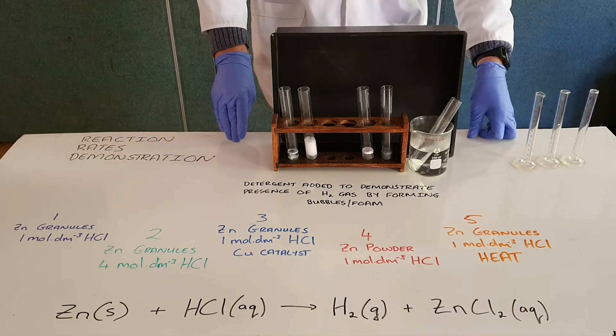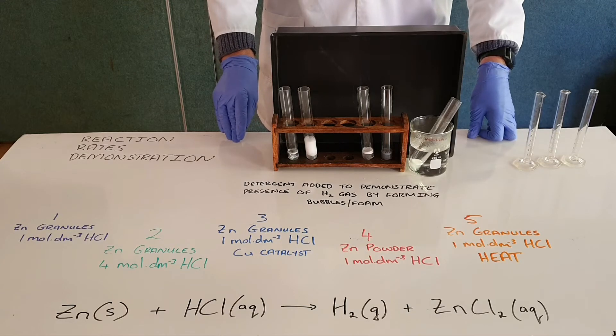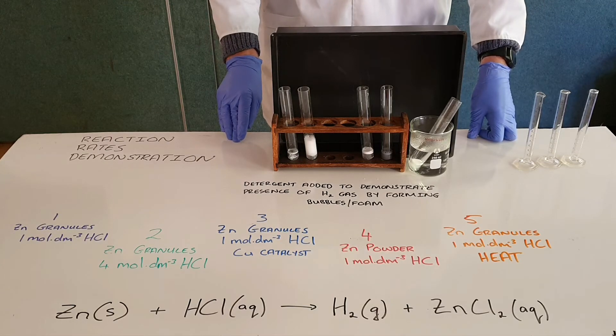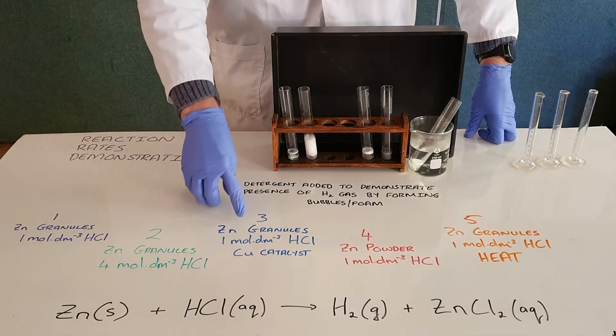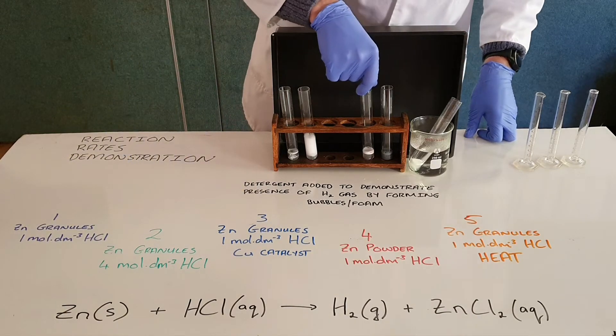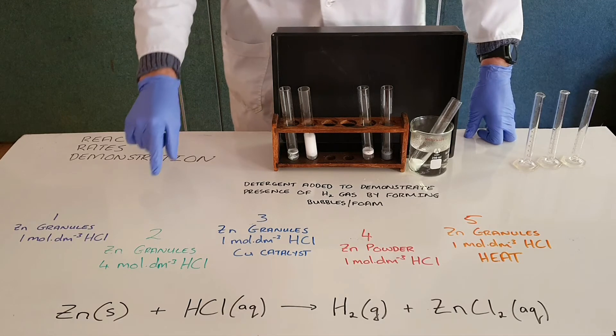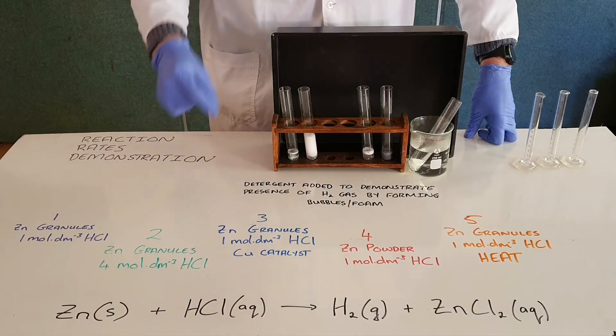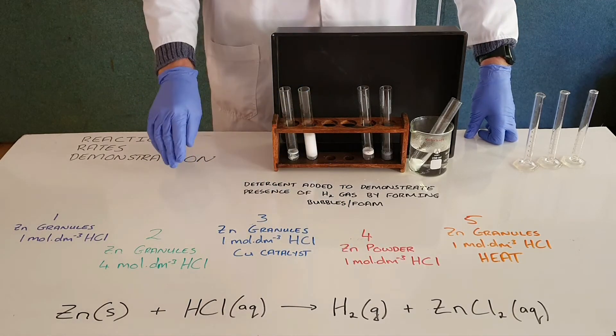We know that a catalyst provides an alternate path for the reaction to proceed by, and so we would expect this reaction to happen faster than our reaction in test tube number one. And we can see that that is indeed the case. We can see that more foam is formed, meaning that more hydrogen gas is being formed in that test tube.